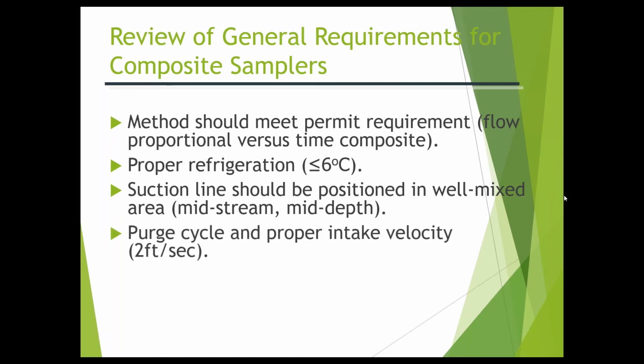There's a purge cycle. So when you run your sampler, before it takes a sample, you want it to purge. That's a good practice because, like you'll see later on, if you're in a sunny state, especially in the summertime, algae grows in these tubes like crazy. And all it takes is a little bit of water. So you want to rinse this tube out before you take your sample, because the last thing you want to do is go to take your sample and now you clean the sample tubing into your sample container.